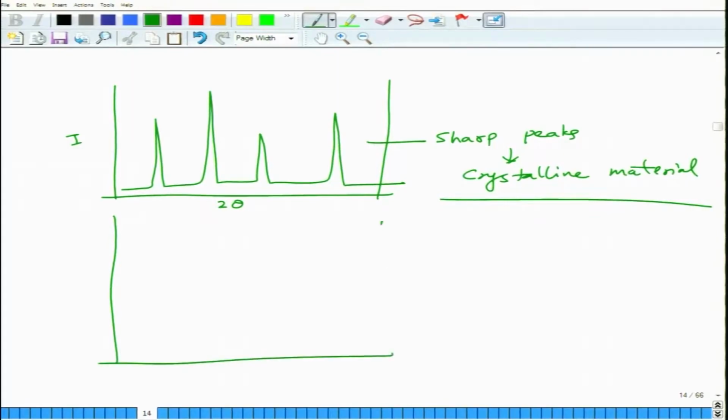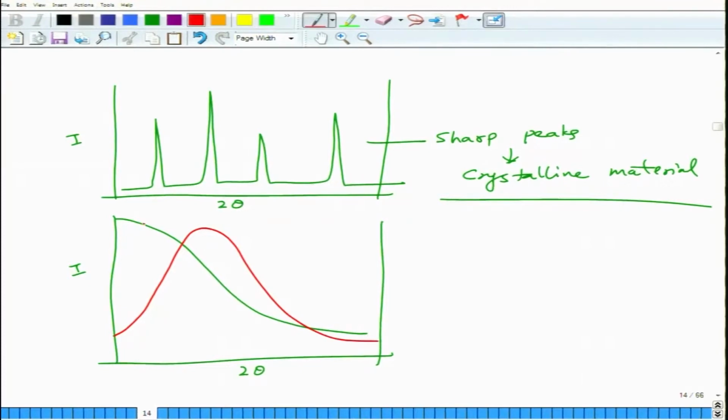If you have a pattern of intensity versus 2 theta with a very broad hump, starting from a very low angle, the first kind corresponds typically to gases, which do not diffract and just show a broad hump, and this one is from a liquid-like phase such as glasses.